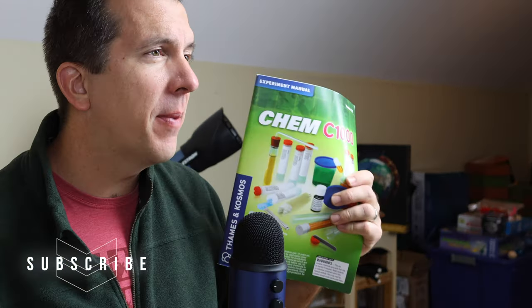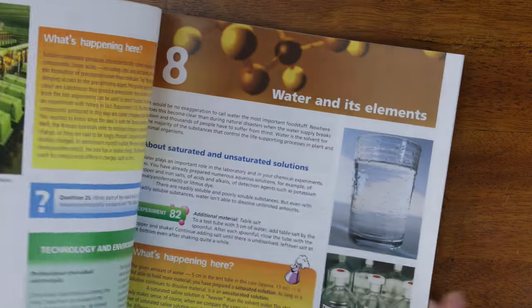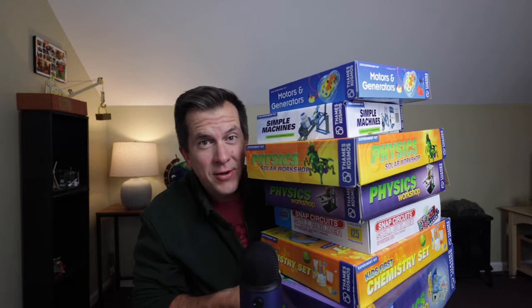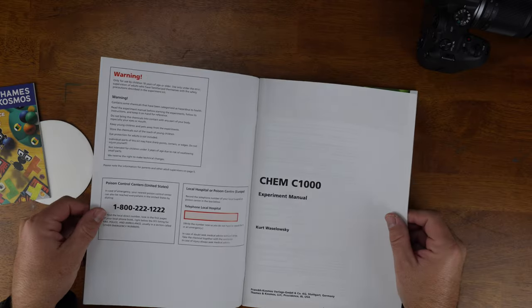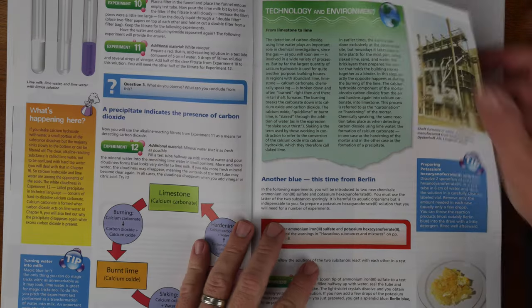My kids and I are going to do some actual experiments in a second, but first let's talk about the best thing this kit has going for it right out of the box, and that's the book that comes with it. At over 80 pages, this is hands down the best Thames and Cosmos book I've ever reviewed, and I've reviewed a lot of Thames and Cosmos kits over the years on this channel. The pages are vibrant, the instructions are easy to read, but more importantly, there is ample supplemental reading material that sometimes talks about the history of the chemistry experiment or how it's used in modern day. I can't stress how important that is from the point of view of a former science teacher.